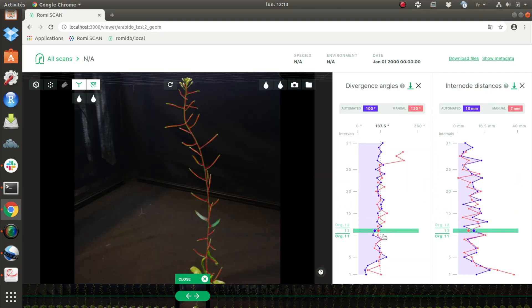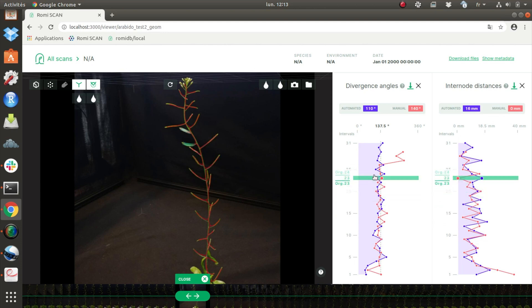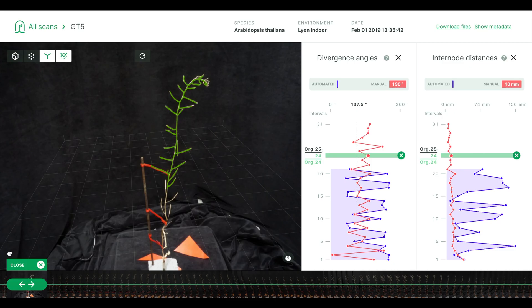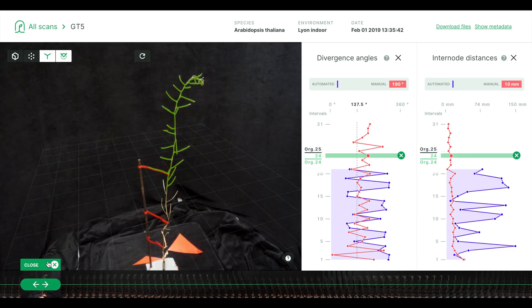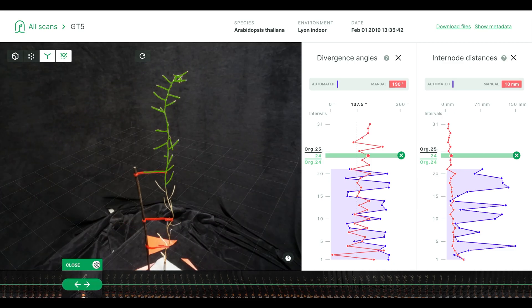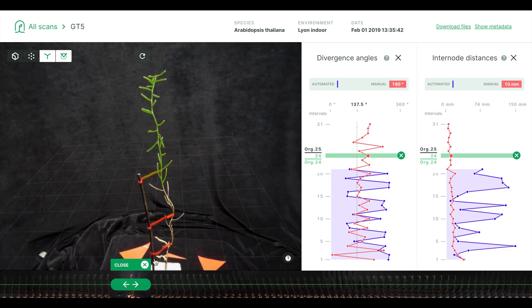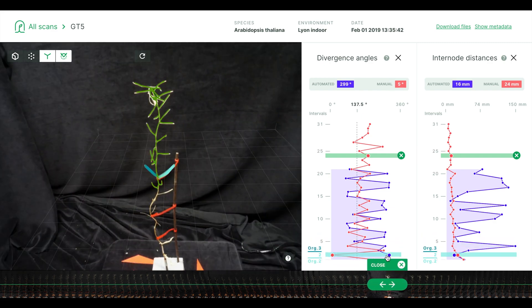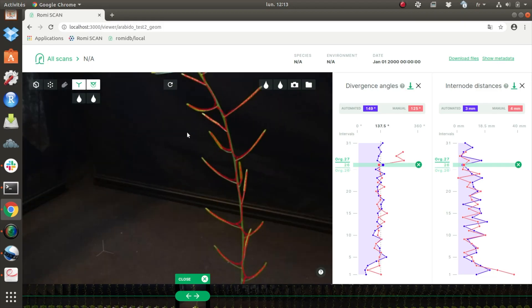To make some shoot traits accessible to routine or exploratory phenotyping, automation is crucial. Moving the camera rather than the plant ensures that the plant can remain still, providing more precision.